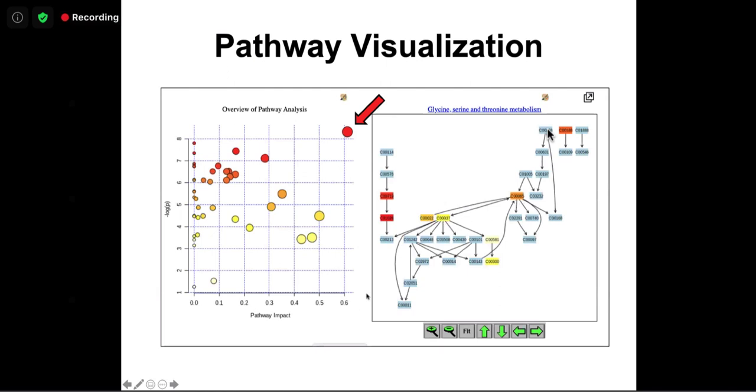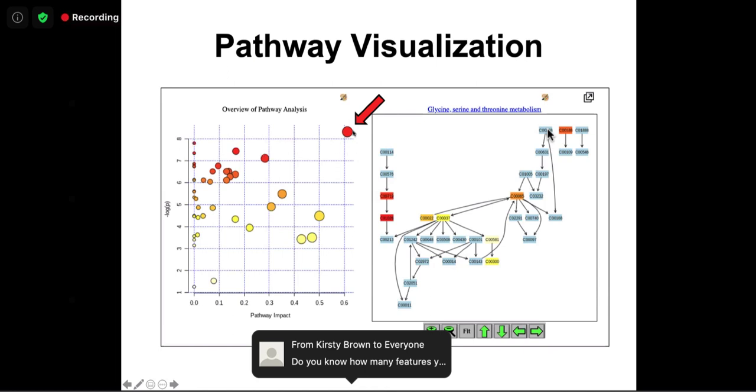Yeah, this is not rocket science. We just do a lot of normalization to make sure it's compatible, and also assume the upstream should have higher impact than downstream, and then they are added up together. Whether there are better ways, I do believe there could be, but I'm not quite aware. Also, it needs some benchmarking: how do we interpret it proportionally? For example, here and here, we all agree. But here, probably you don't want to see that. So clearly the algorithm reflects this. If you change it here and change it here, even with the same number or more metabolites, it will probably be discounted here. So you will be equally significant, but not going to be on this side.